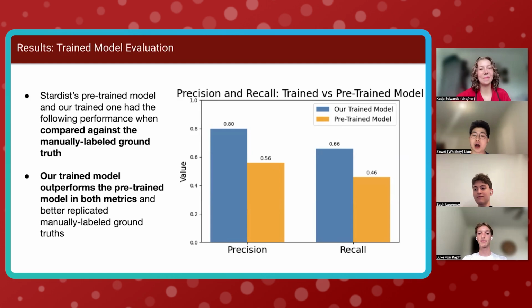So therefore, our model accomplishes the first goal of creating labels that will be similar to as if we were to manually create them, which is the gold standard. And it doesn't come with the immense cost and amount of time needed to actually curate them manually.